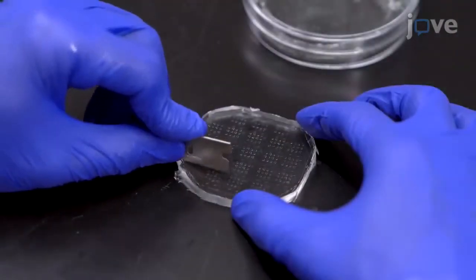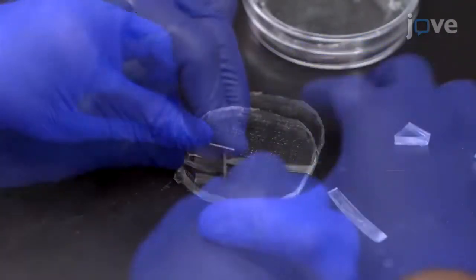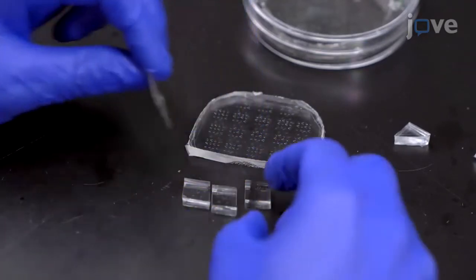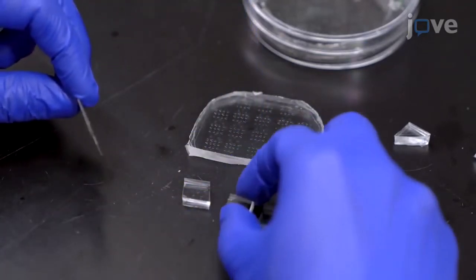Then cut the PDMS into roughly 10 by 10 mm squares, each containing the features for a single experimental condition. These will be referred to as stamps for the remainder of the protocol.